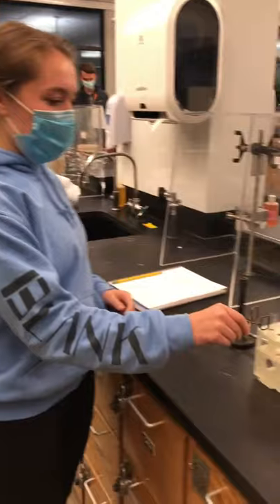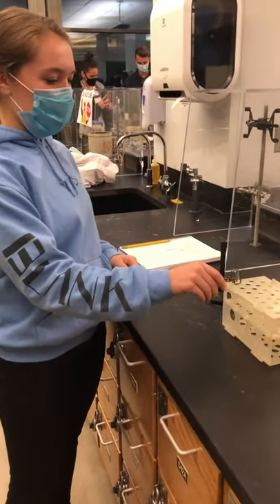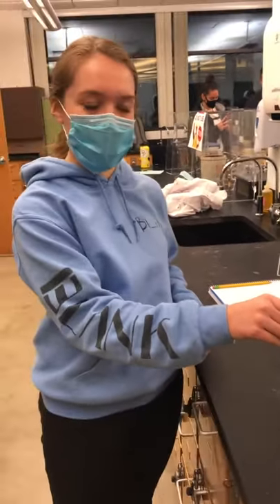So, first thing you grab it and get a good hold on the test tube with the test tube clamp.